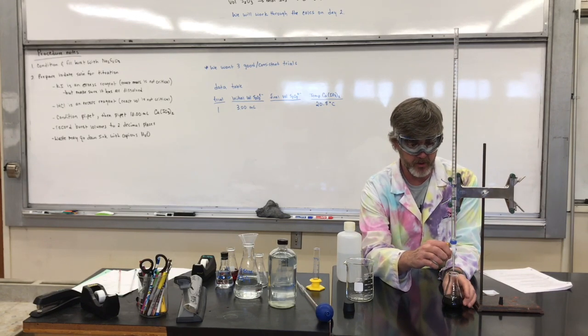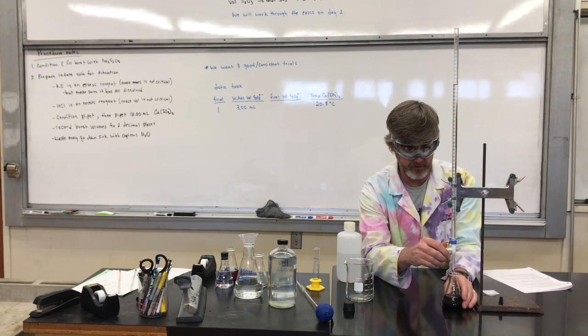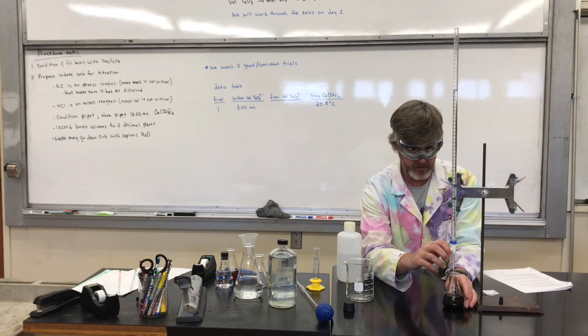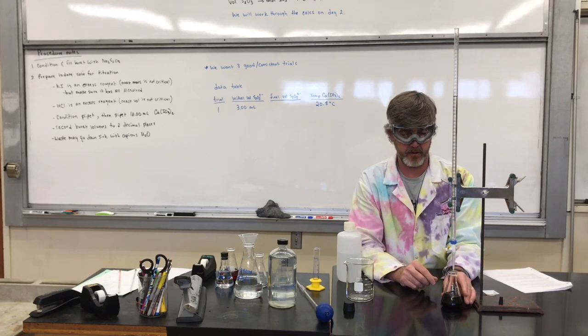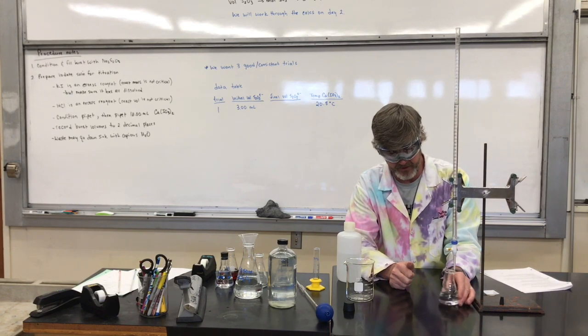I'm going to start going fairly fast because I know it's going to take more than 5 or 10 milliliters. And I'm going to get to a point here, I'm going to swirl and start slowing down a little bit. We want to get to that point just where that deep blue disappears and our solution turns clear. Whoa, I started seeing a little bit of clarity there.